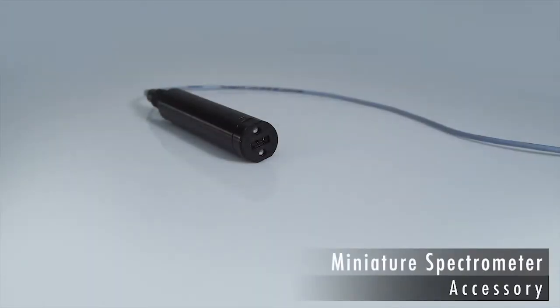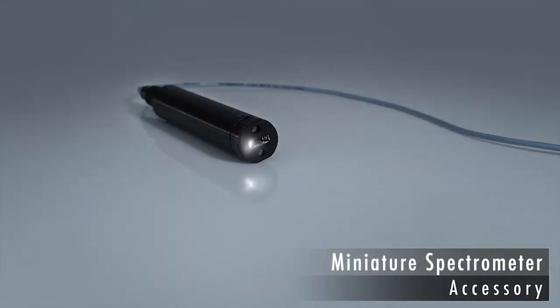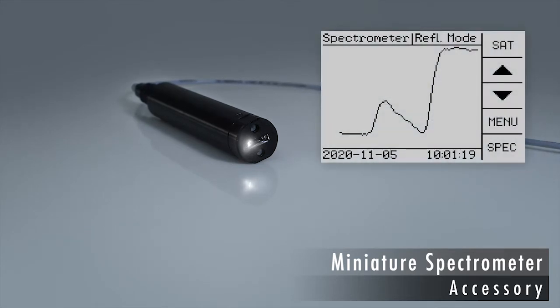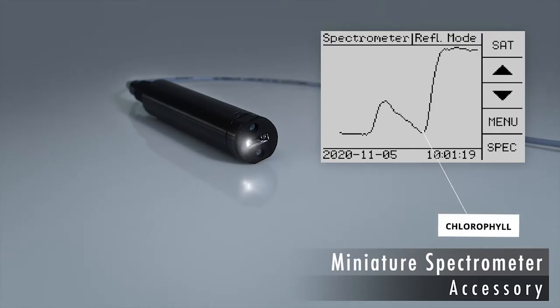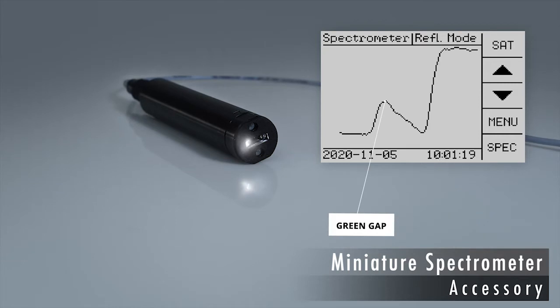The miniature spectrometer can be converted to measure spectra of reflectance or fluorescence emission. For reflectance measurements, a white light source is employed. Reflectance spectra resemble the inverse absorption spectrum of the leaf. The long wavelength absorption of chlorophyll appears as minimum, and the green absorption gap of leaves appears as maximum.